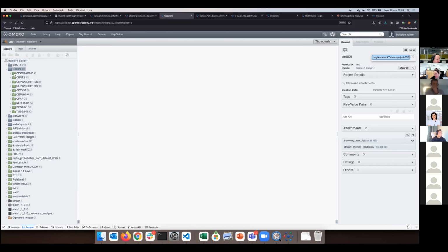A lot of elements in that case will be done, for your case probably, via some of the CLI tool, which, similar to the rendering settings, you define a JSON file and then all the parameters are picked up and then converted. So there are many cases like that.